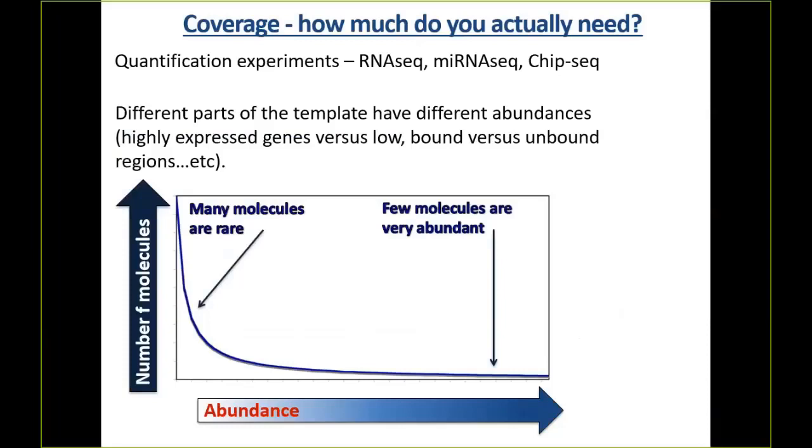So, I think just about everybody here was talking about doing RNA-seq. Anybody know what the most abundant RNA is in just about any cell, but especially a mammalian cell? Ribosome. In just about any mammalian cell, the most frequent RNA you're going to pull out, if you just pull out bulk RNA, is going to be ribosomal RNA.